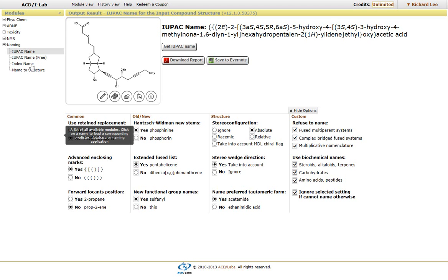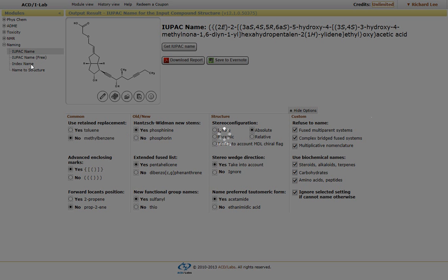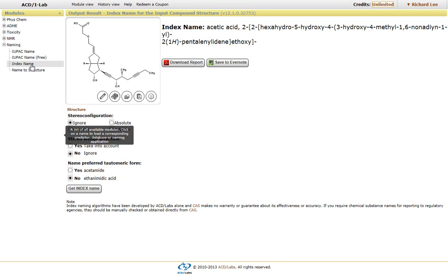If you click on the index name, it will generate the index name. It could be different from the IUPAC name, and there are some rules that can be applied to generate the index name itself.